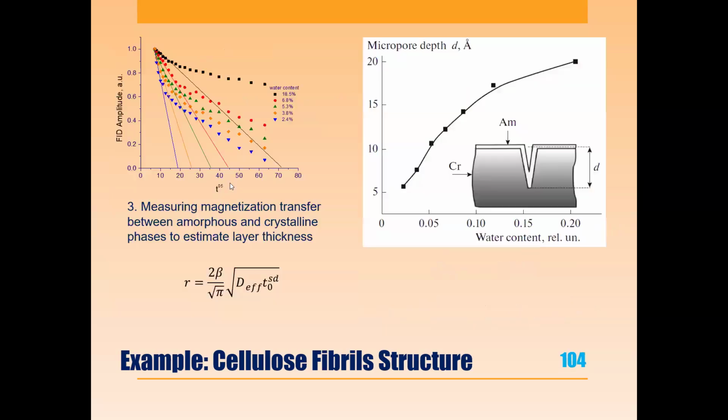Then we tried to analyze these samples. Maria today mentioned the spin diffusion measurement of domain dimensions. Then we implemented the sequence that is used to observe the polarization transfer.